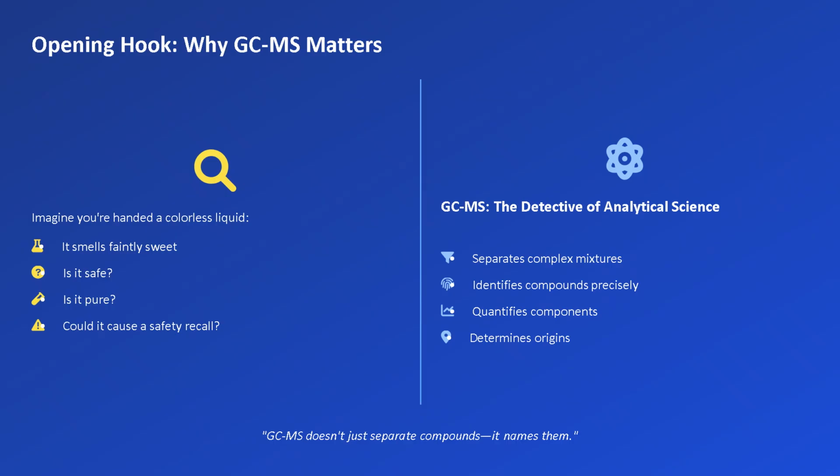Imagine you're handed a colourless liquid. It smells faintly sweet, but that's all you know. Is it safe? Is it pure? Could it contain trace contaminants that might trigger a safety recall? This is where GC-MS steps in as the detective of analytical science.